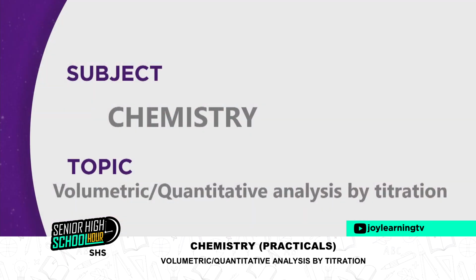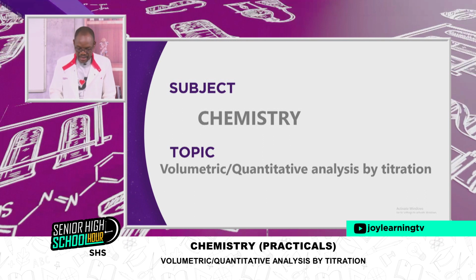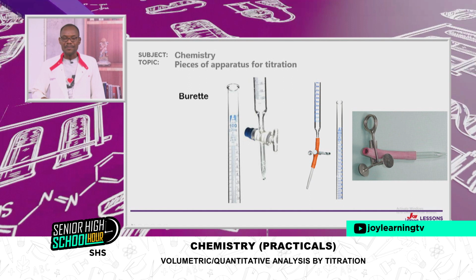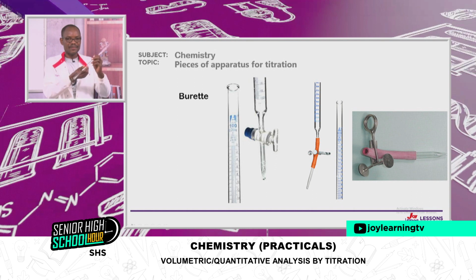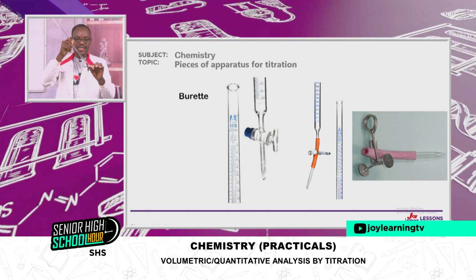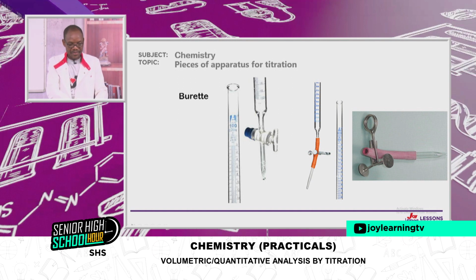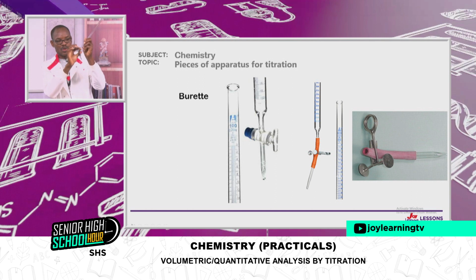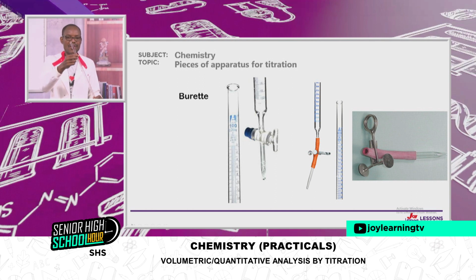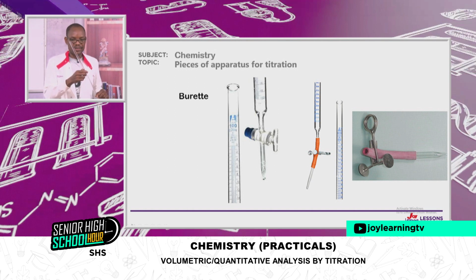So we want to look at it one by one as we assemble all the things that we need in this process. The first on our list is the burette. This is the burette. This is the clip, this is the tip of the burette. Don't forget, this one has a rubber tubing connecting the tip to the main burette. And the burette can reach a maximum of 50 centimeters cubed.